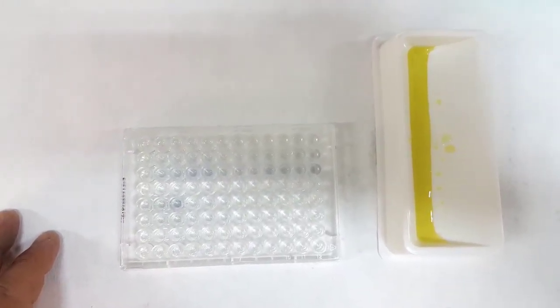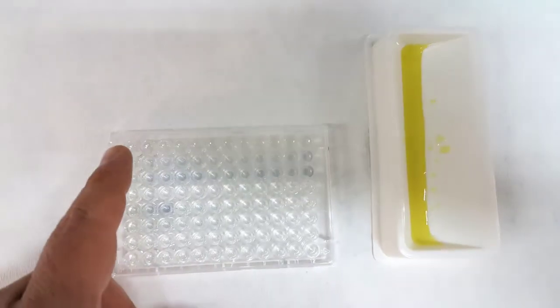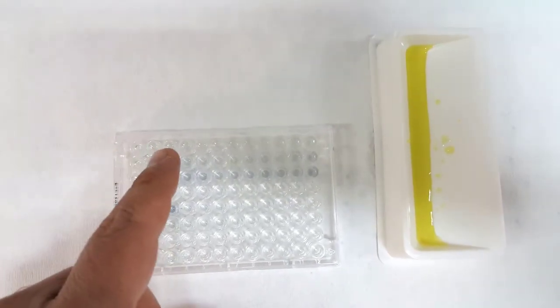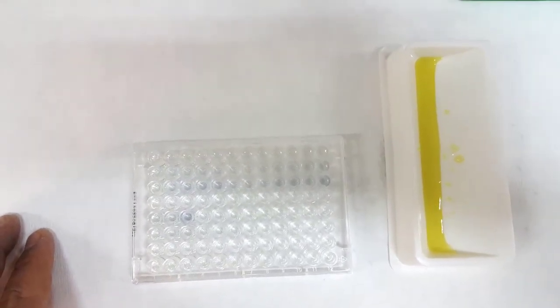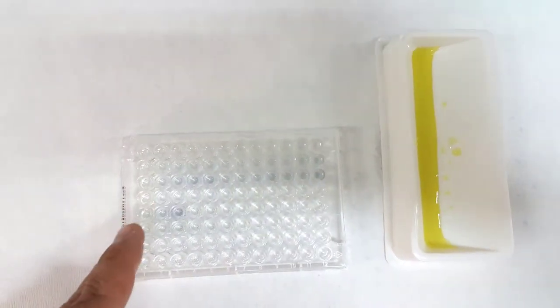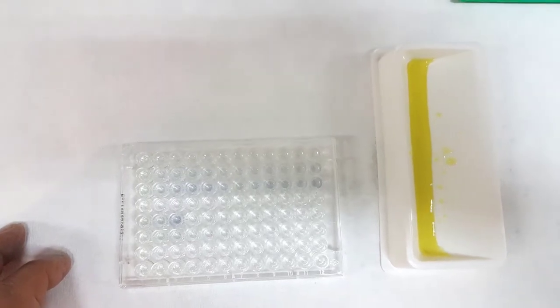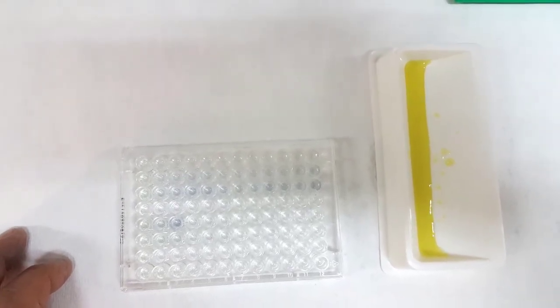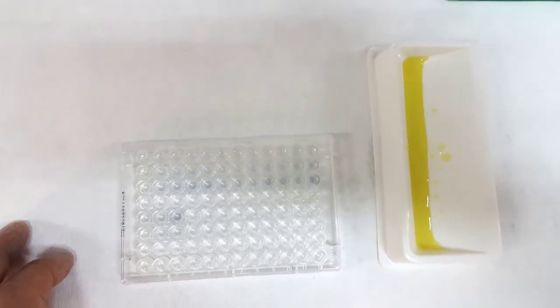As you see, the color in each well changes from yellow related to blanks to blue related to standards and samples. The higher the protein concentration in the standards or samples, the more intense blue color.